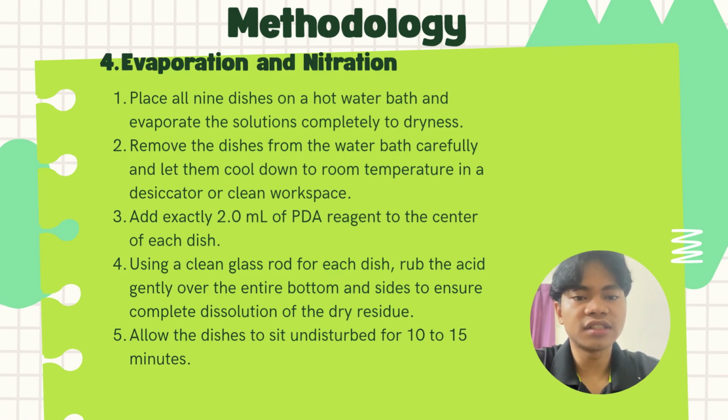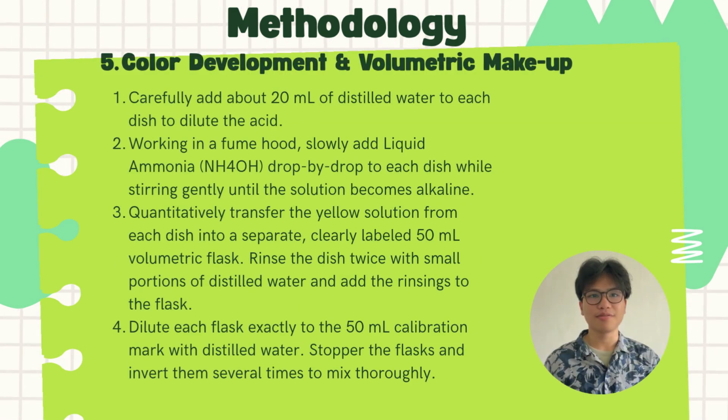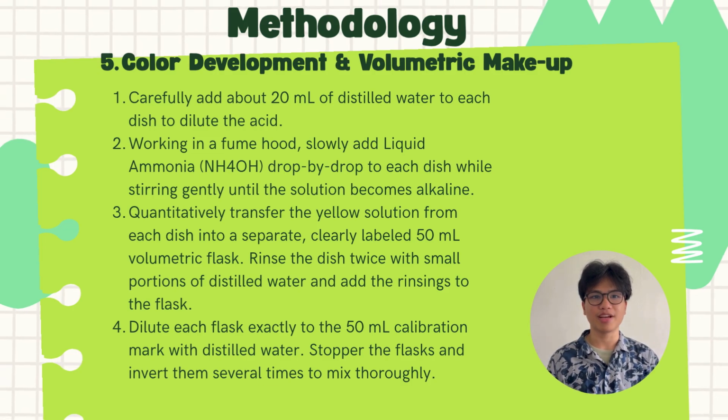Finally, the dishes were left undisturbed for 10 to 15 minutes to allow the nitration reaction to occur before proceeding to the next steps, color development and spectrophotometric measurement. Next, onto the color development and volumetric makeup.